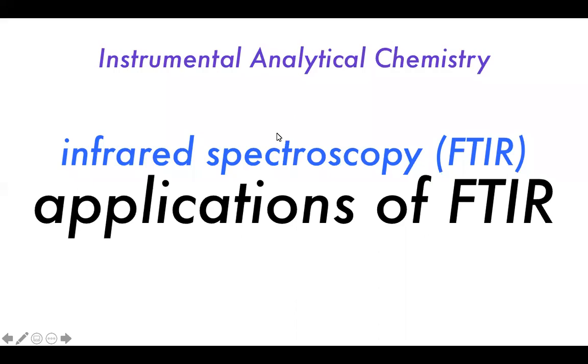Hello and welcome to this next session on infrared spectroscopy, where we will be discussing the applications of FTIR spectroscopy. So we'll be looking at not only quantitative, but maybe also some qualitative methods of use of infrared spectroscopy and discussing some other use cases, such as in kinetic studies and things like that.